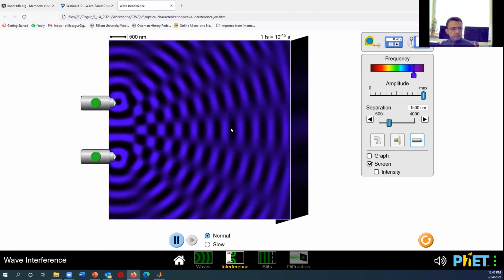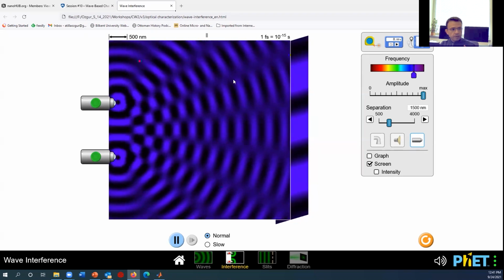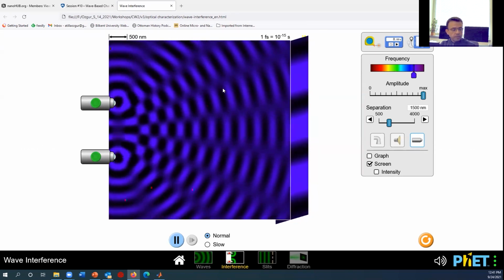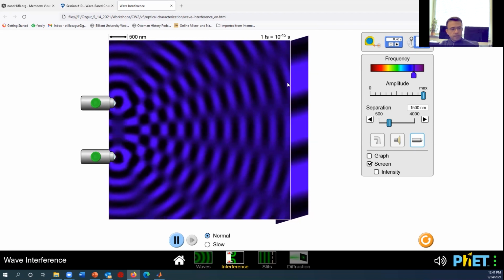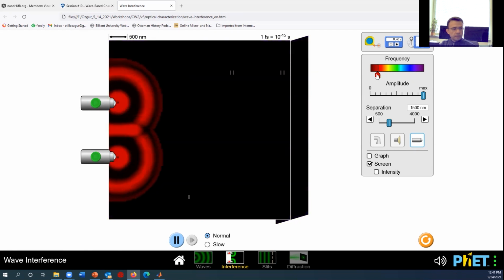I hope you can see it. It's not just the zeroth diffraction order like I introduced and the first diffraction orders, but we have other diffraction orders appearing too. And the idea is, as the wavelength changes, let's go back. I would like you to look at the occurrence place of the first diffraction order. Let's look at it. So it's like here.